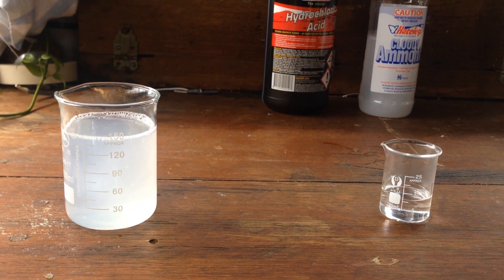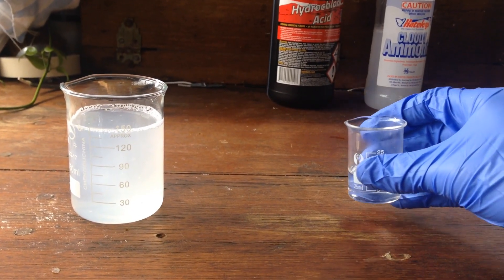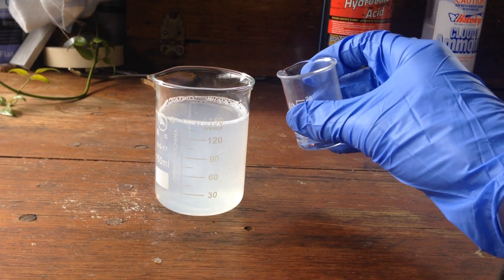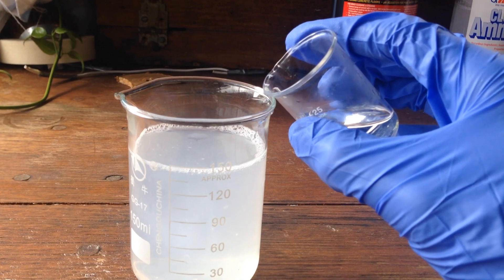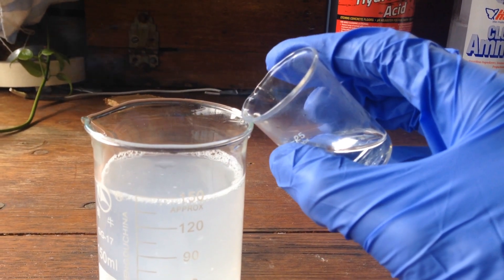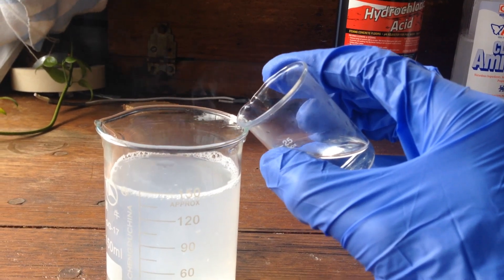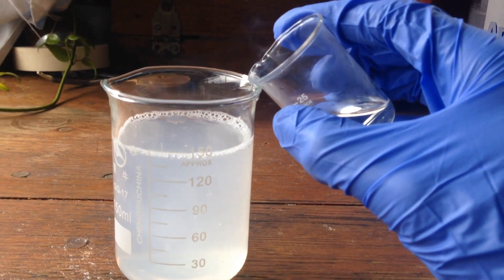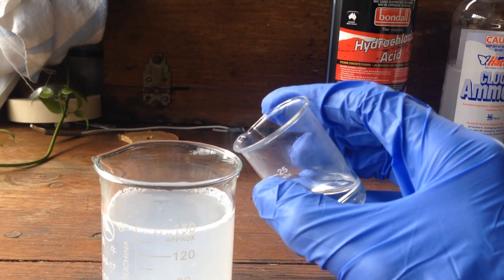An interesting thing about hydrochloric acid and ammonia is that both of these chemicals fume with their corresponding acid and base. So if we bring the liquids close together, you can see that the fumes will spontaneously react together in the same way that we'll be reacting them later on, to give this kind of mist of ammonium chloride particulates in the air.